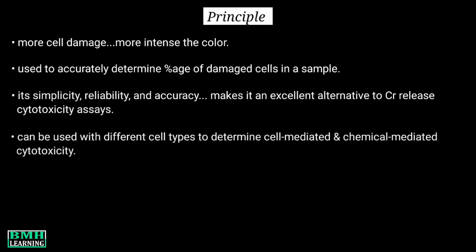The assay can also be used with different cell types to determine cell-mediated and chemical-mediated cytotoxicity. Apart from this, the assay is ideal for cell-free supernatant from cells in culture.